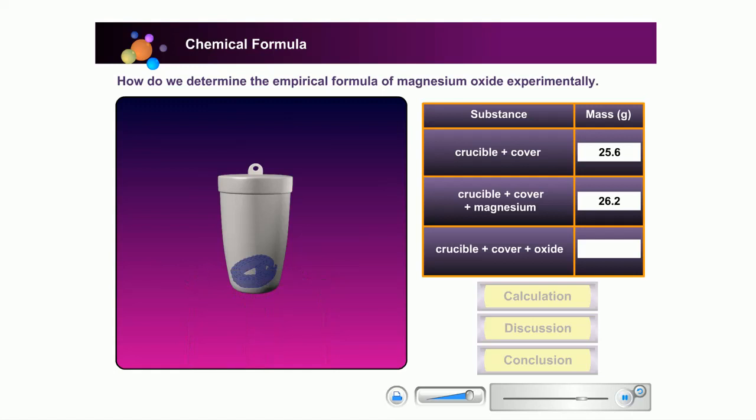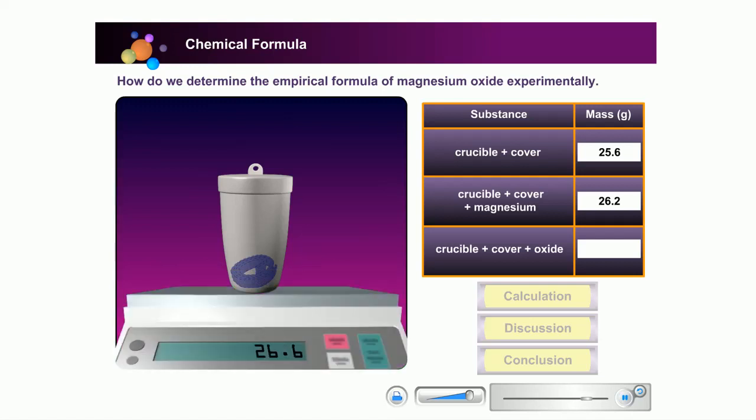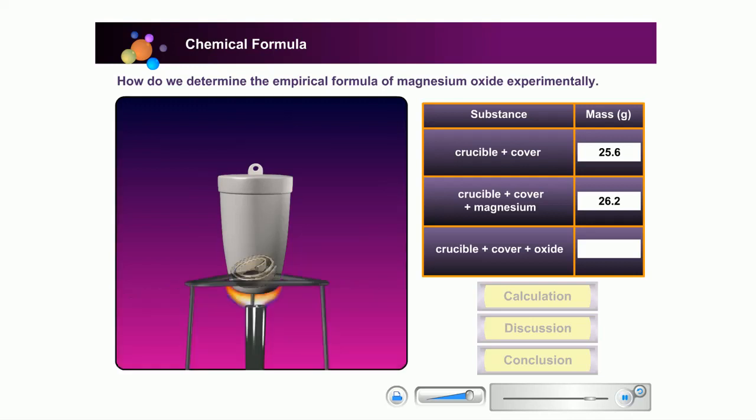When the magnesium stops burning, cool and weigh the covered crucible. The mass is recorded. Repeat the heating, cooling and weighing until the final mass becomes constant. Record the reading. Key in the final mass in the table.